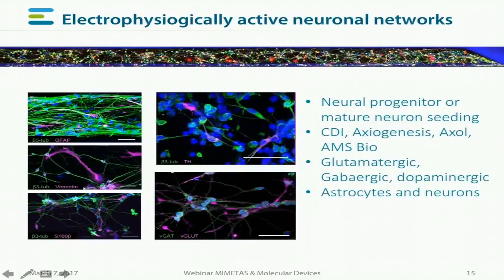So here's a full lane containing neurons in a two-lane plate. We can do a range of marker stains on cells which are fixed inside the plate. Antibodies are added inside the plate and washed out, and subsequently the models are photographed during fluorescence microscopy.